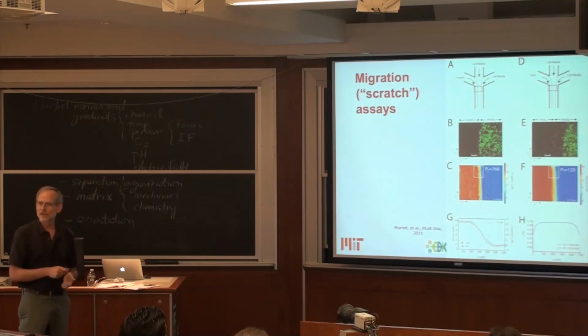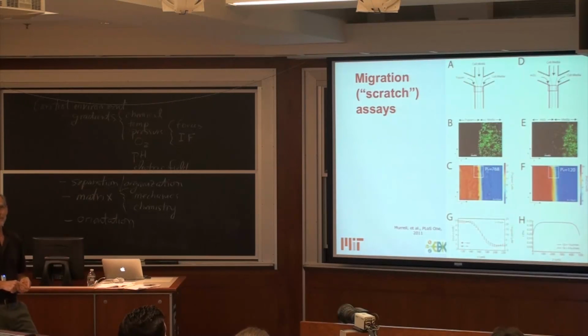Well, we also talked about scratch assays. Back at Jeff Redberg's talk, remember he was looking at the migration of cells from a monolayer, and they did the scratch assay. They wiped out the cells on one edge, and somebody asked the question, are you damaging the cells on the edge? Is that influencing the behavior of the cells?